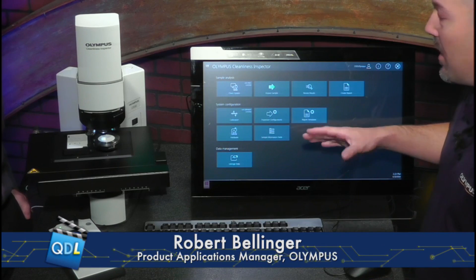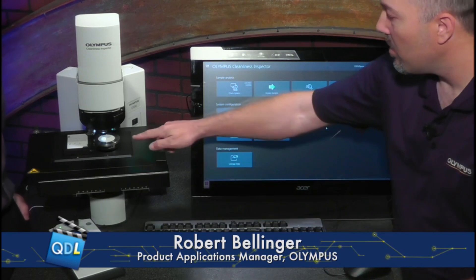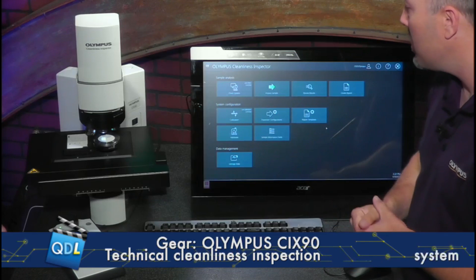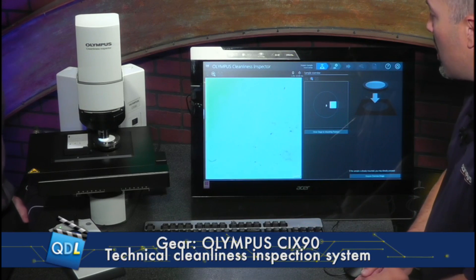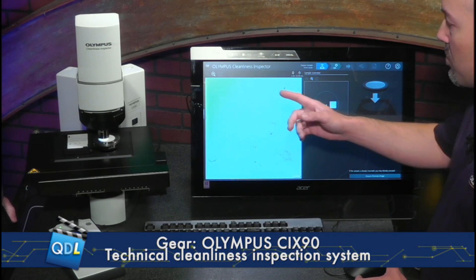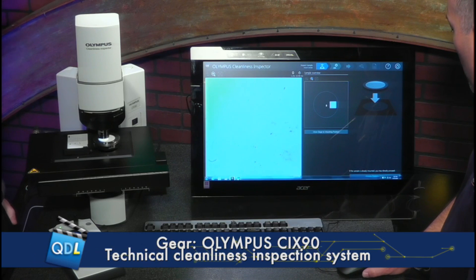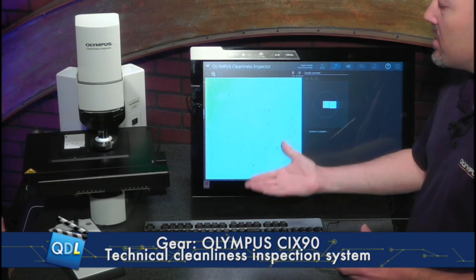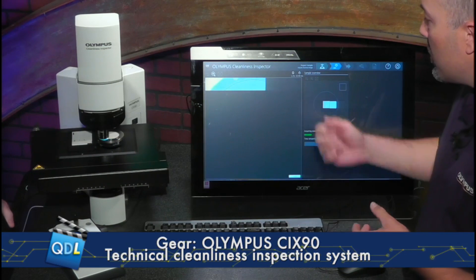Along with the new system is a whole new user interface. New software that's been streamlined and made very user-friendly. It's meant for any operator to walk up, pop on their filter assembly on the stage — a new filter cap that locks down the filter and flattens it out for easy scanning. Then the operator comes right to the screen; it's a nice touchscreen system now, making it an easy interface. They hit run inspection, and this uses a very low-mag lens to do a quick overview scan. It starts doing an autofocus, so the Z is also automated — the user doesn't have to try to focus on anything. After autofocus, it acquires an overview scan.